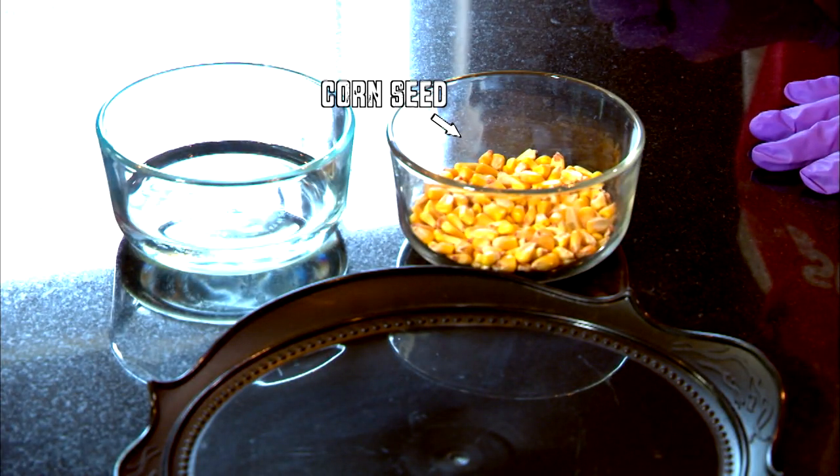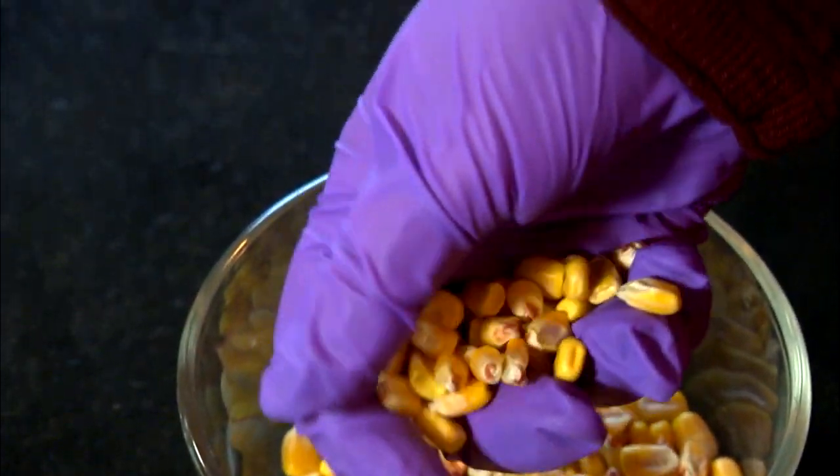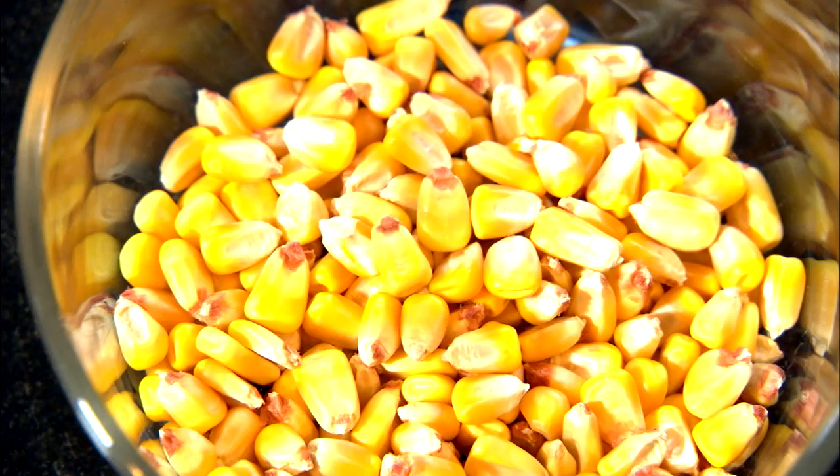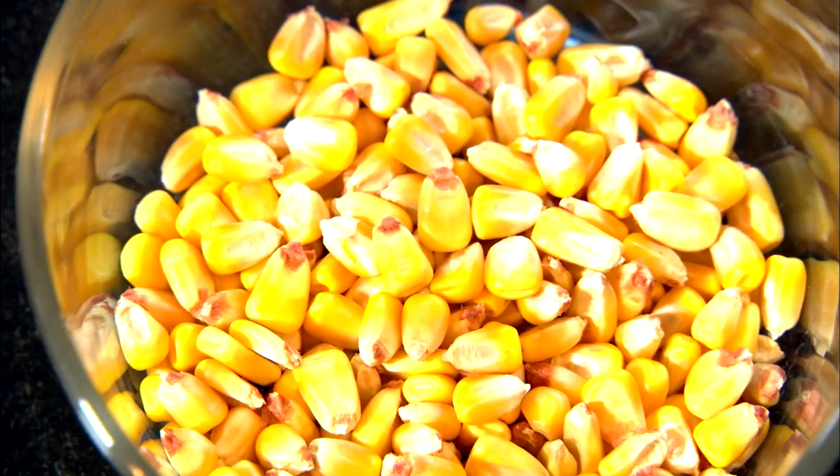You'll need a corn seed and a paper plate. Seeds are covered with an outer seed coat for protection. Inside it is an immature embryo containing all of the genetic material for the plant, and endosperm tissue which stores proteins and starches needed for the embryo to mature.